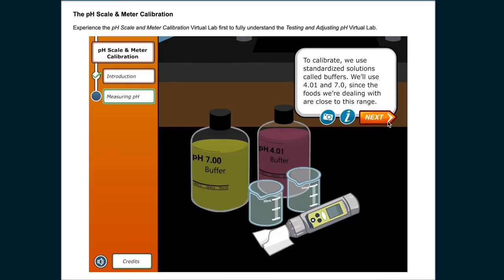To calibrate, we use standardized solutions called buffers. We'll use 4.01 and 7.0 since the foods we're dealing with are close to this range.